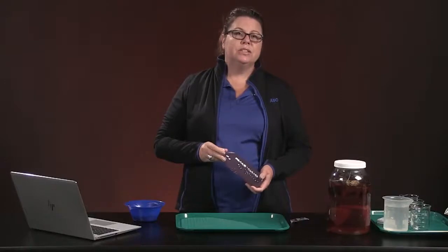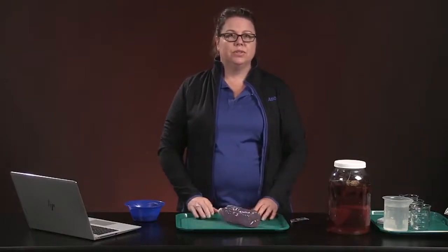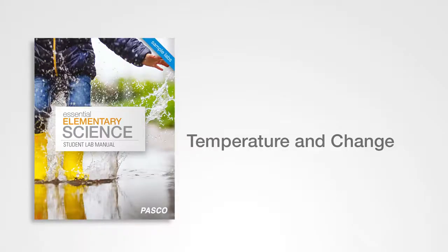Today, you will be building on this knowledge and investigating what role temperature has when mixing solutions. What effect does temperature have on the time it takes for a solid to dissolve? This is temperature and change.